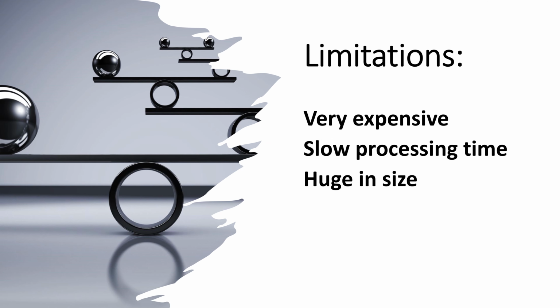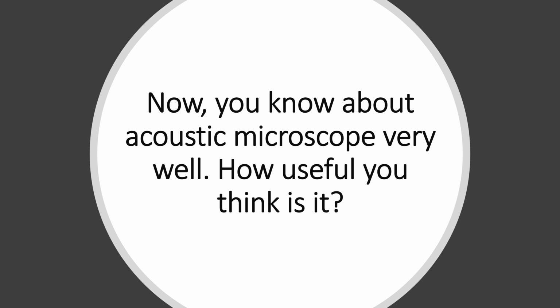We saw benefits of acoustic microscope, but there are some limitations too. First, it's very expensive. Second, it takes longer time to process. And third, it's very huge in size. Now, you know about acoustic microscope very well. How useful you think is it?